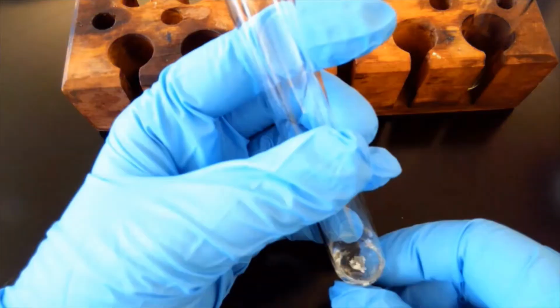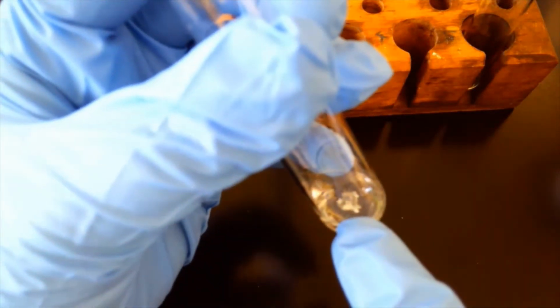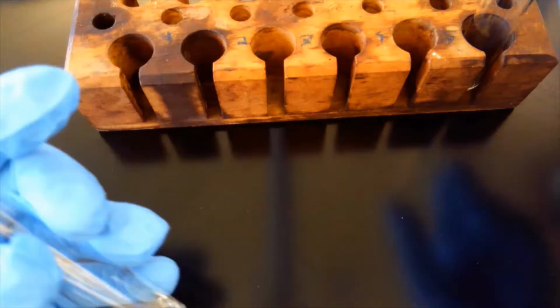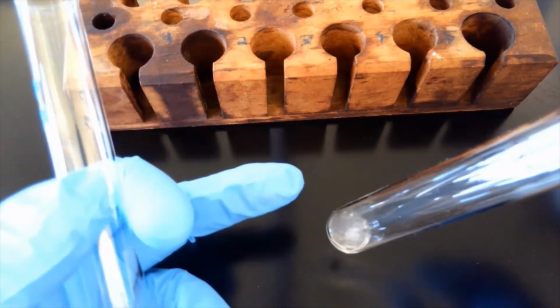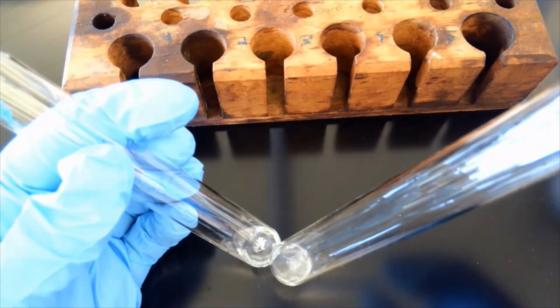It's just really small bubbles right at the top. It's probably a little harder to see, but very minuscule. You can kind of see them coming off. Nowhere near as vigorous as the HCl. Little tiny bubbles.